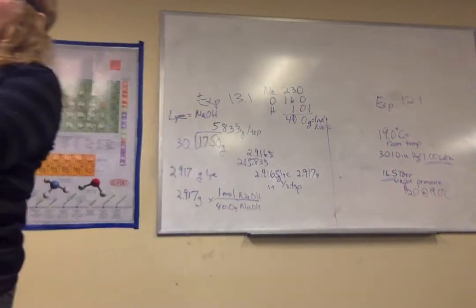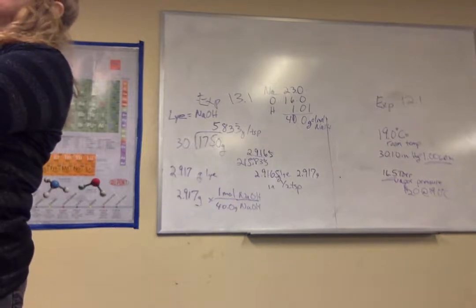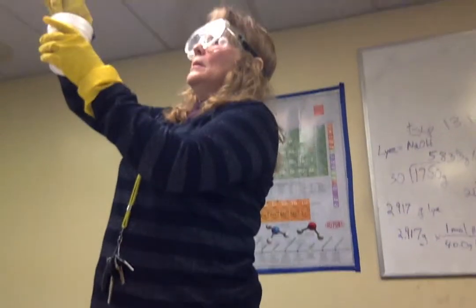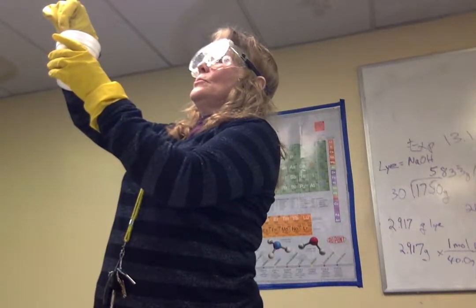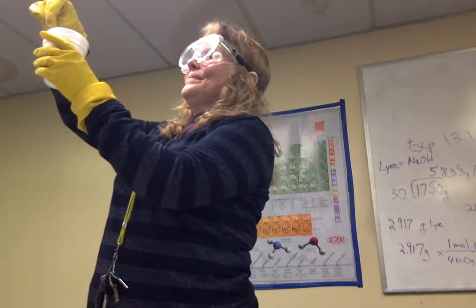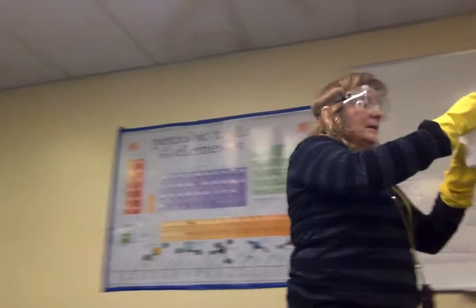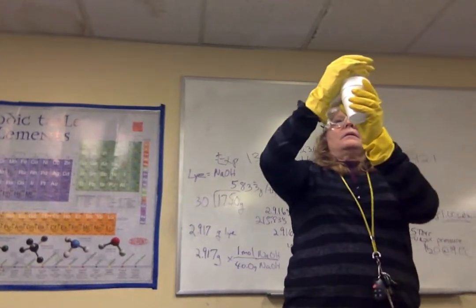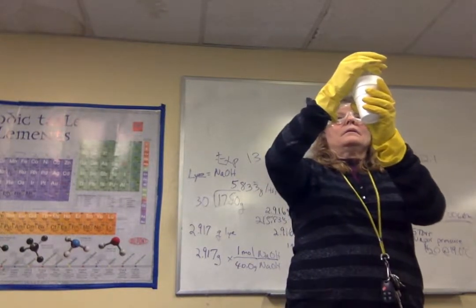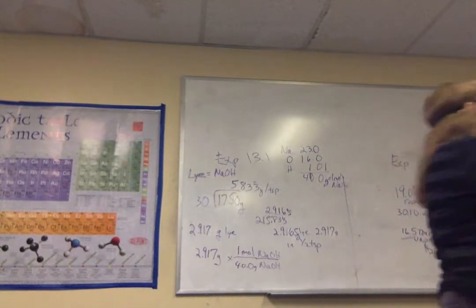I'm measuring it now. It's going to probably be about room temperature. It's like 18.2. 18.2 degrees Celsius. That's the initial temperature. Yep, that's T initial. 18.2 degrees Celsius, so we don't have to convert it to Kelvin. See, it's just so much easier.